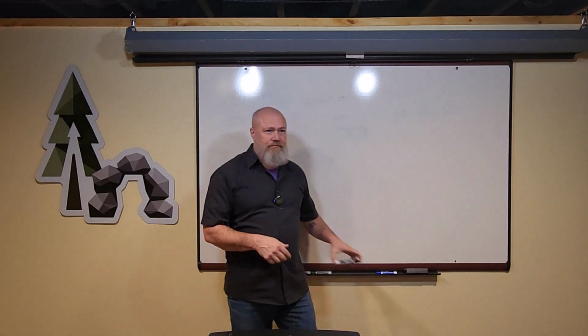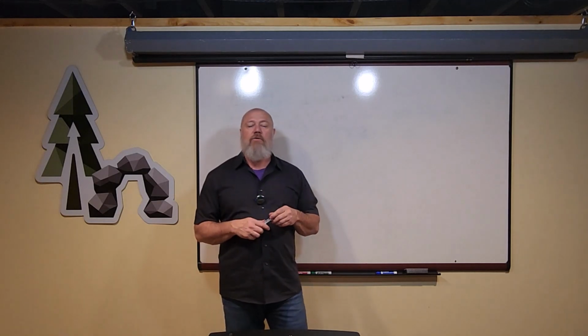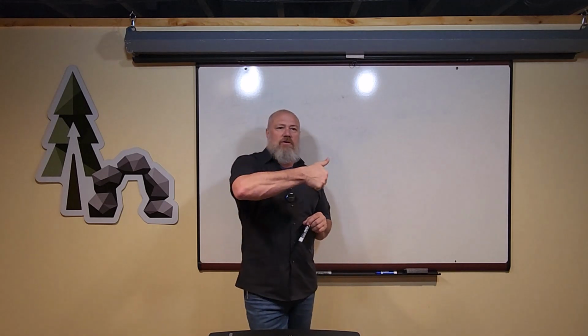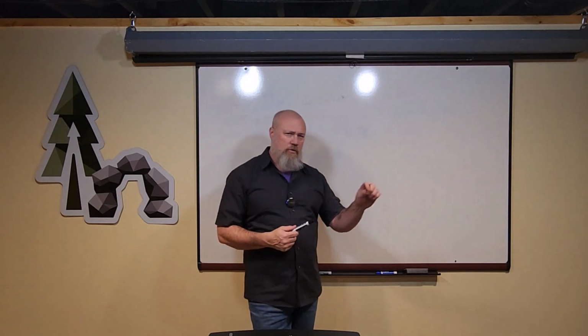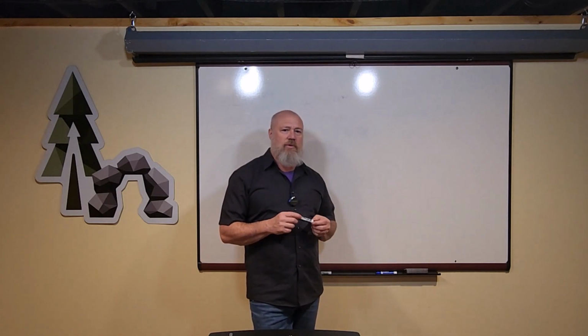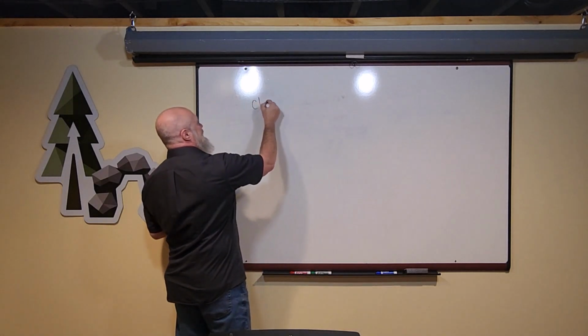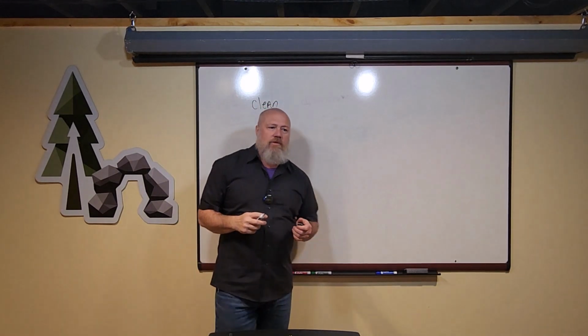And then besides dissecting, there's a few terms you want to know. First, I'll say things like blunt dissection: fingers, probes, scissor technique. Sharp dissection, that's going to be scalpels and scissors, always using the forceps, the hemostat, keep your fingers away. We're going to say, I want you to clean and tag. Clean and tag structure X.